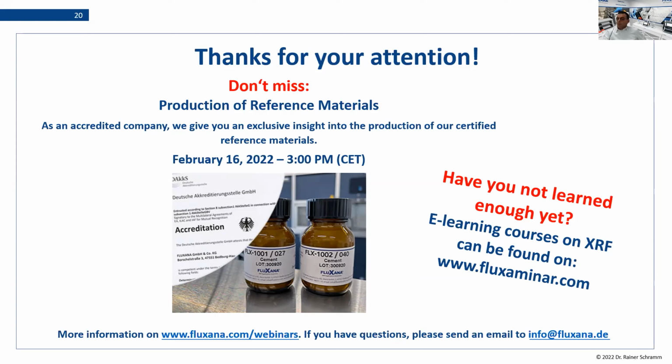Then for press pellet calibration, how similar should the particle size be in the calibration standards and in the real samples? The same. It must be the same, because all theoretical approaches and all calibrations cannot take into account the particle size. So, further question.